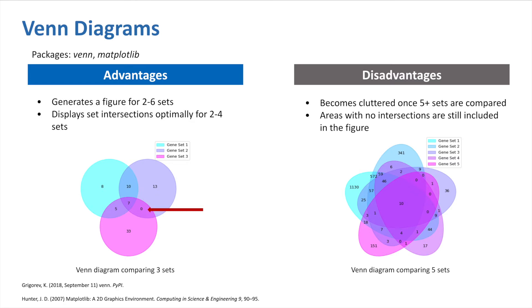We can see here that we have a Venn diagram comparing 3 sets and another Venn diagram comparing 5 sets. The Venn diagram comparing 5 sets is a lot more cluttered and it's not as easy to interpret the overlaps of the sets. Another disadvantage we can see in the 3-set Venn diagram is that areas that don't have any intersection are still included in the diagram, which isn't always useful information.